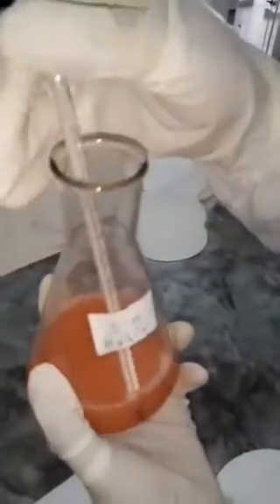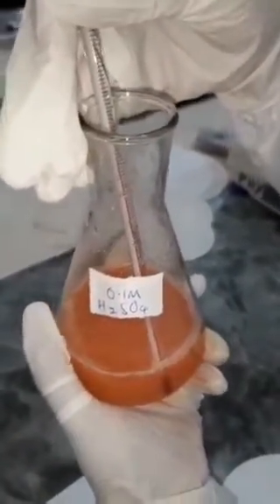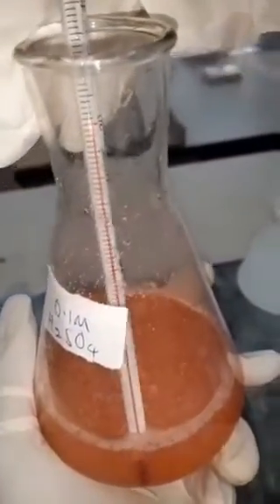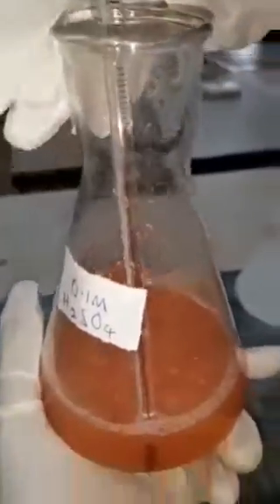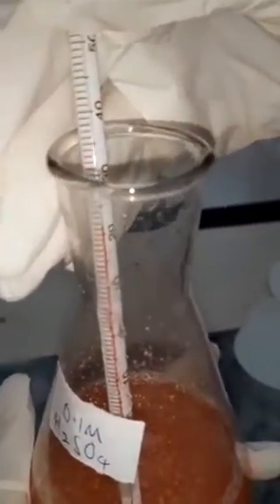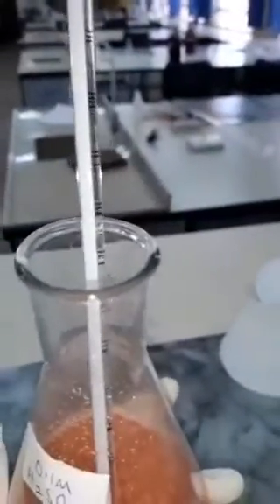But in order for us not to overheat, we're going to measure the temperature of the solution before heating, and then we're only going to heat it 5 degrees above the solution at room temperature. So the solution is at 21. It's at 21.5 or just 21. So we're going to heat it up to 26 degrees Celsius. Okay. So as you can see, I've heated it to exactly 26 degrees Celsius.